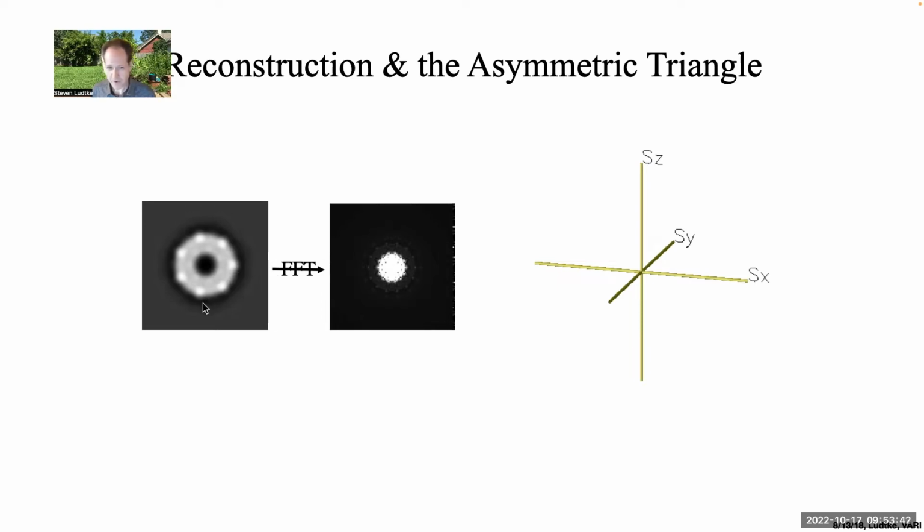But from a very simplistic perspective, a Fourier transform takes an image and it produces another image, and you can go from this image back to the original image without losing anything. So this is an alternative representation of the image. In the Fourier space, the middle represents very coarse, very low resolution features, and the edge represents very high resolution features.